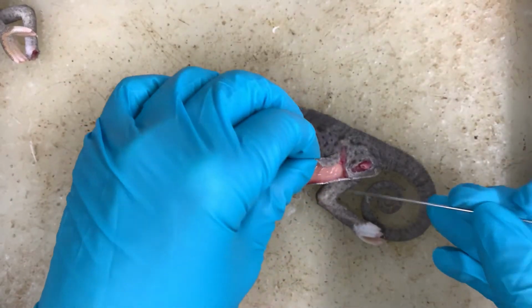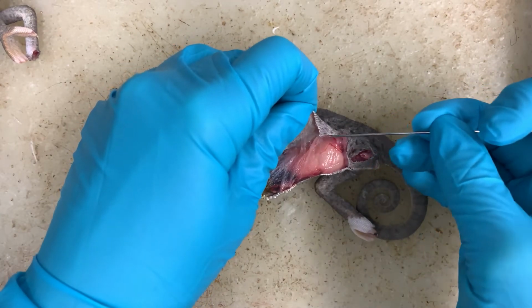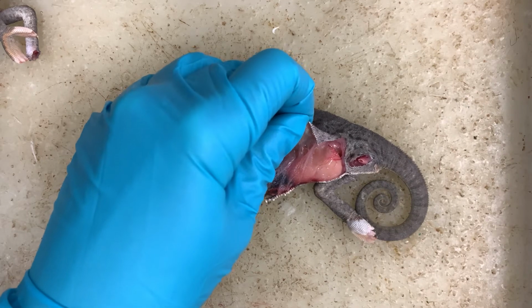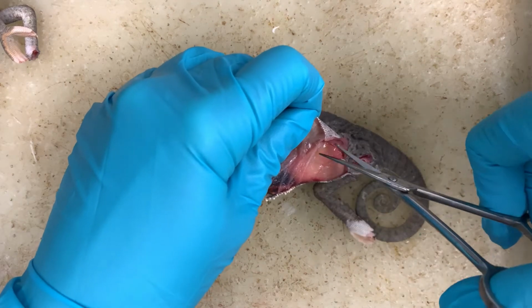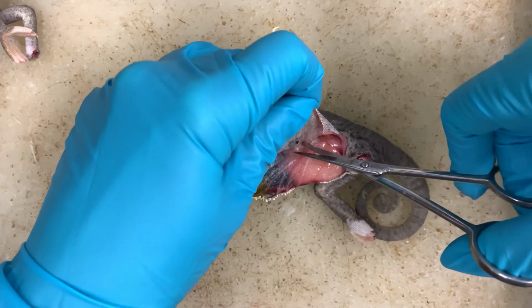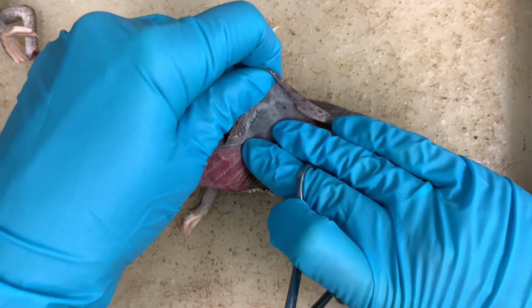To prepare the chameleon from the left side, the left forelimb and hind limb are removed. A shallow incision is made along the left side of the ventral midline, and we work the skin away from the viscera using probes, scissors, and gentle pressure. We can then cut away this flap of skin.